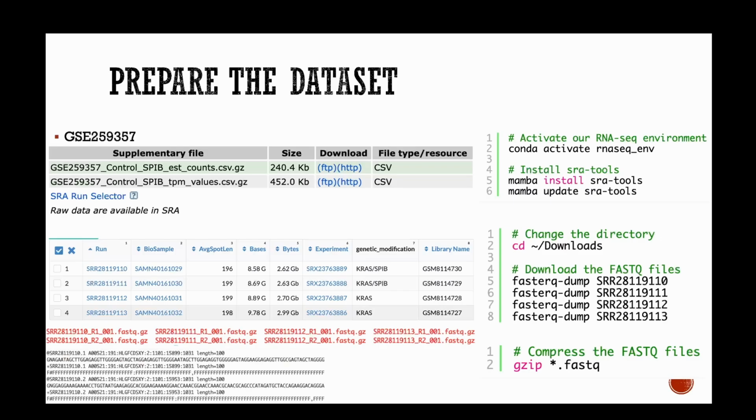So inside of a FASTQ file, there are entries. Each entry has 4 lines. The first line is the ID, second line is the actual sequence, third line, ID again, fourth line is the QC score. It doesn't matter if you understand it or not, because it's not meant for humans to read.